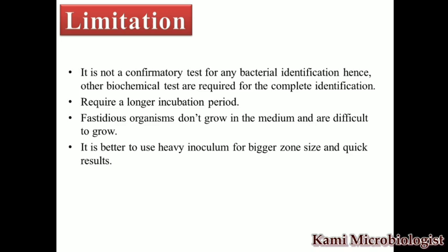The limitation of the test is that if we want to identify the bacteria, it doesn't mean that we should perform only this test. For bacteria identification, we need additional biochemical tests, as we already discussed. This test requires longer incubation because there are also anaerobic bacteria, and anaerobic bacteria need 3 days.